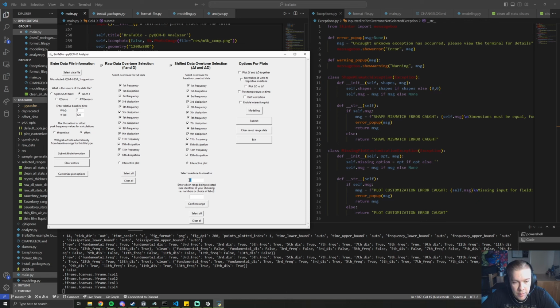It's not that this overtone is the only one that those operations get applied to. This is just the only one that we're looking at, so it's not too messy and we can see things better. This section here is the range being selected. So like I said, we're going to be selecting ranges in the plot, and the data within those ranges will have operations done and the data itself will get saved.